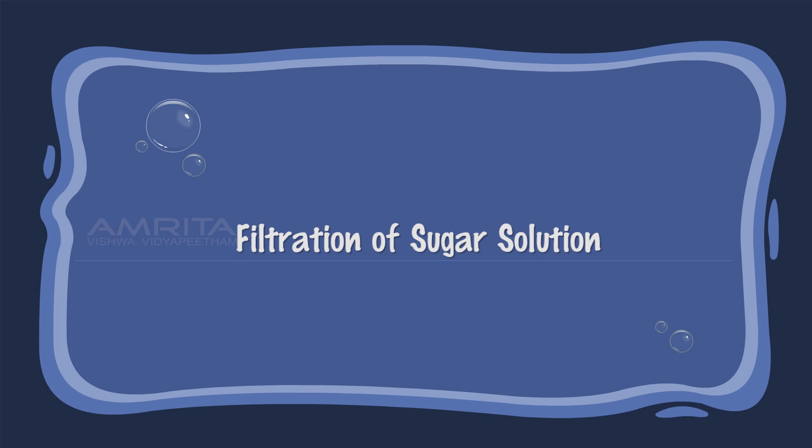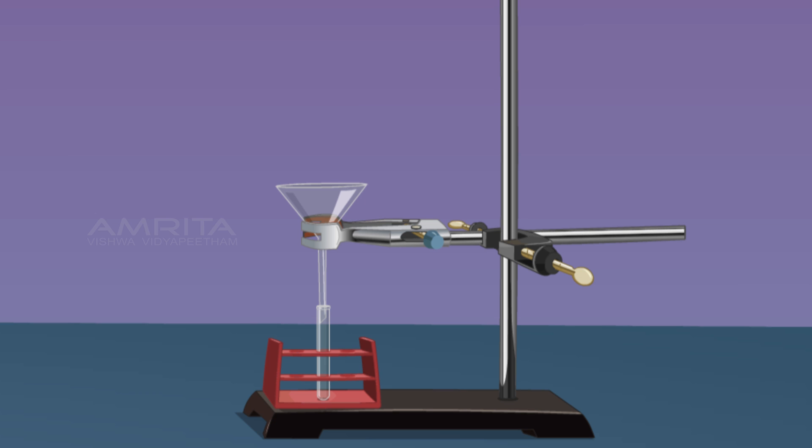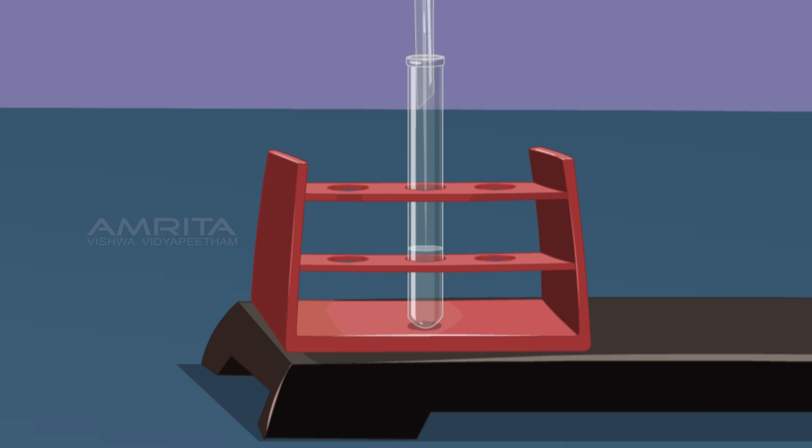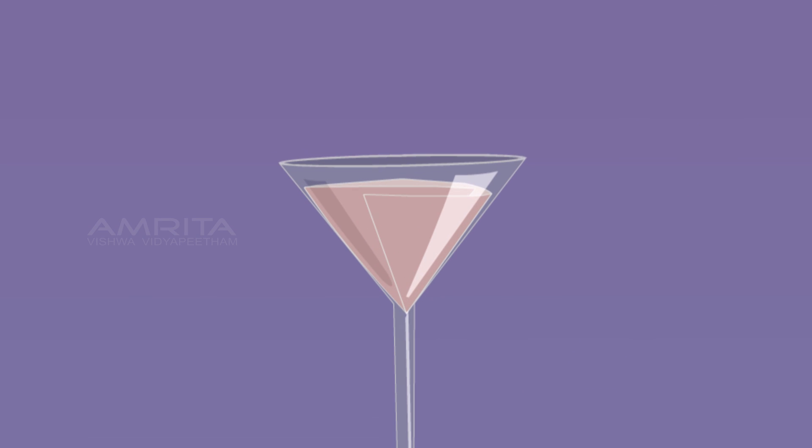Filtration of Sugar Solution: Place a funnel over a test tube using a clamp stand, then place a filter paper in the funnel. Now pour some sugar solution through the funnel. A clear filtrate is obtained with no residue left on the filter paper. This indicates that solid particles cannot be separated from a true solution by filtration.